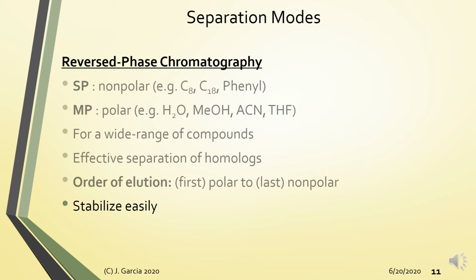Alright, so you go with water while you're slowly decreasing the flow rate, then 50-50 water methanol, then finally pure methanol, and then you're ready to store the column. So when you detach the column from the unit, merong yung kasamang screw plugs, alright, to ensure that the solvent inside the column will not evaporate. So never ever let your column dry out, okay, because once it happens, it's very difficult to revive the column.